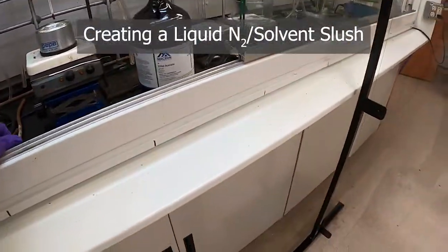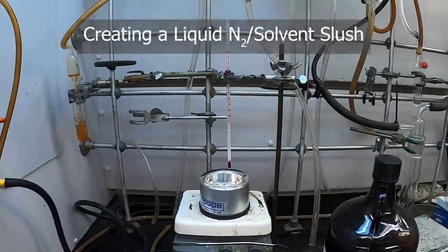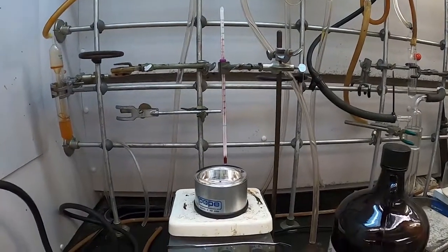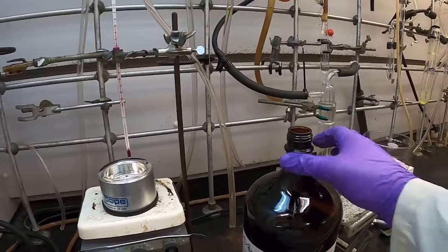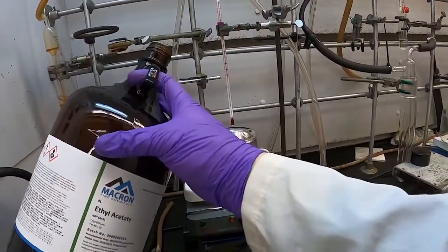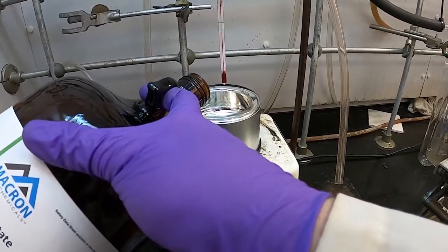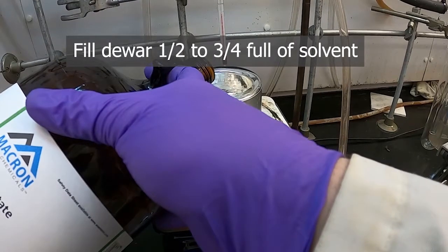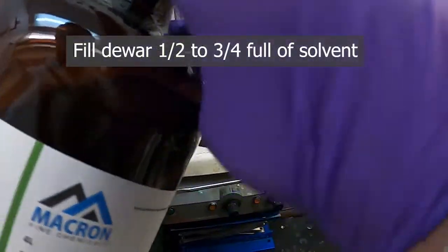So I've got our nitrogen here. So now we're ready to make our bath of ethyl acetate and liquid nitrogen. So we've got our ethyl acetate, our small dish dewar here. We'll go ahead and fill it up about halfway with the ethyl acetate.